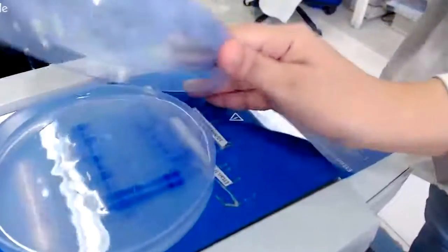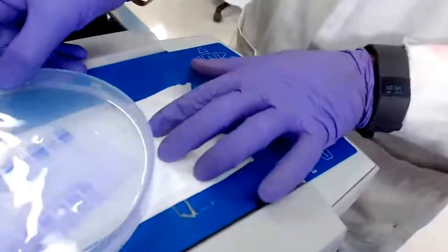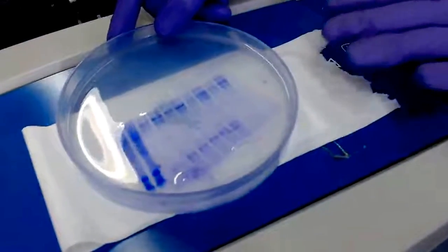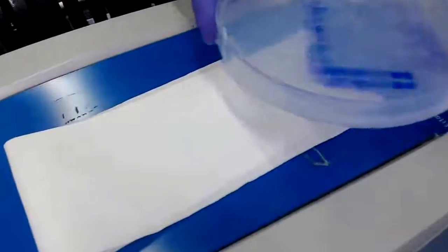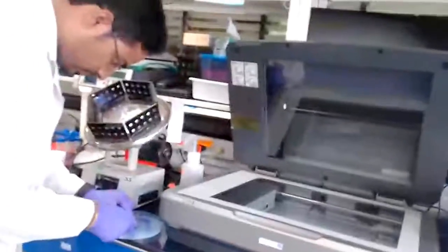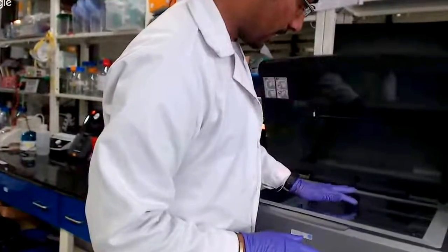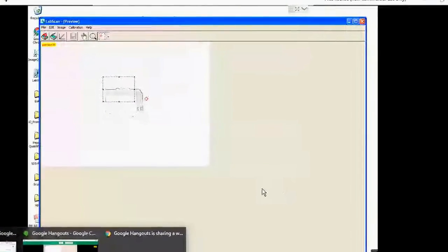This is the gel we are going to scan — these are 1D gels which we have already run. We are going to scan this gel using the lab scanner. When placing the gel, there should be no air bubble between the gel and the glass plate, otherwise it will be reflected in the image. We will show it from the beginning. We close and reopen the LabScan software, which is used to scan our gel images.